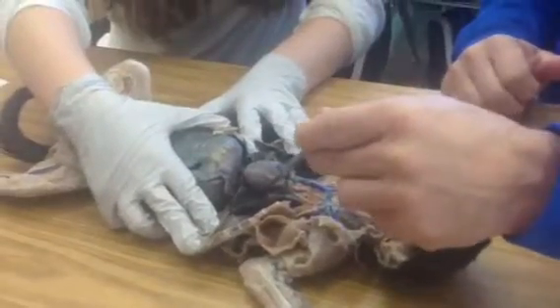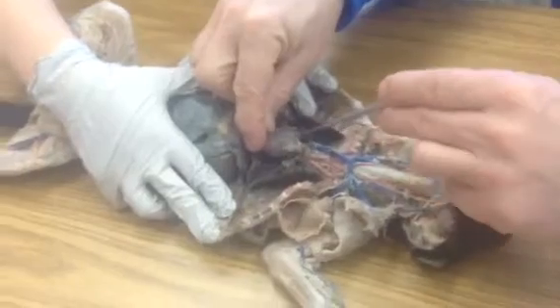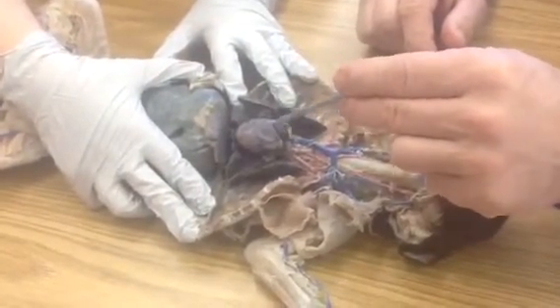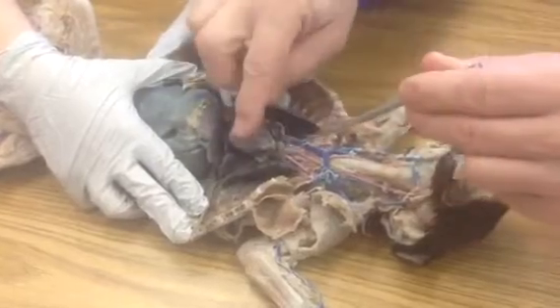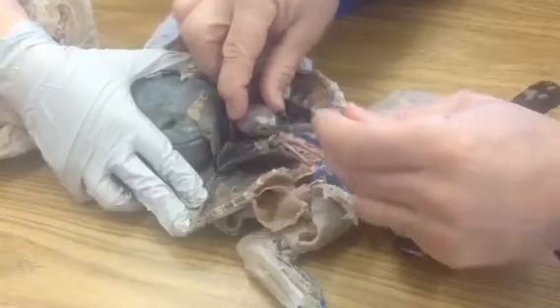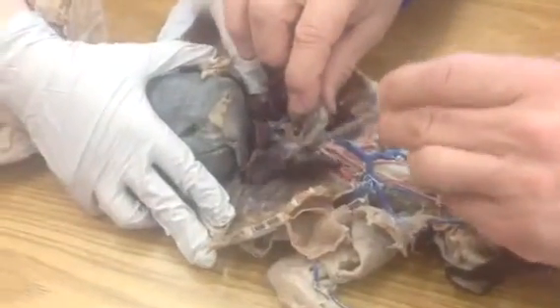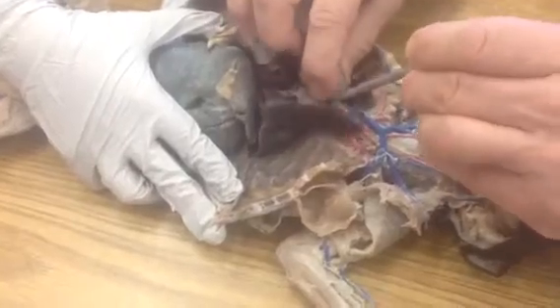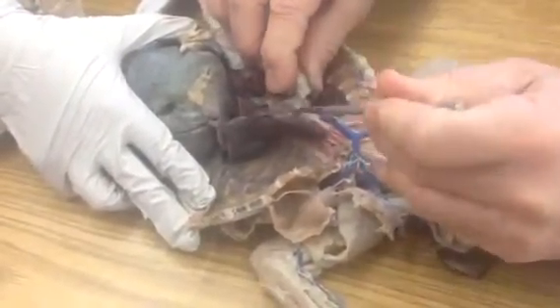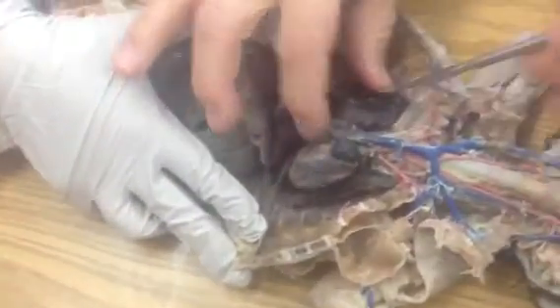Ventricle, left atrium, right atrium, left auricle, right auricle, apex of the heart, coronary artery, which lies within the coronary sulcus. This is your pulmonary trunk. It runs right between the two auricles. The pulmonary trunk is going to branch off into either lung and become, you should have blue in here, that should be a pulmonary artery. You guys have to dissect it out, but that would be the one there. And you'll have one over here, pulmonary artery.